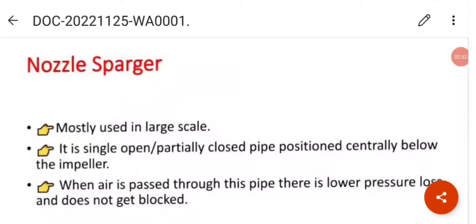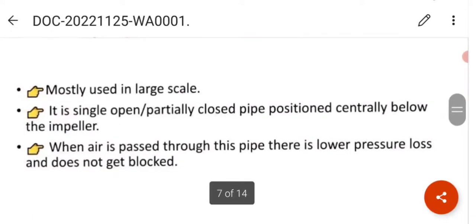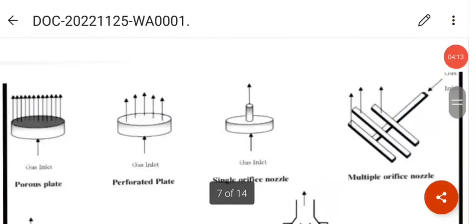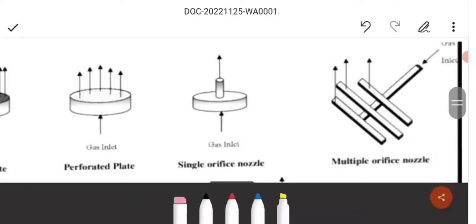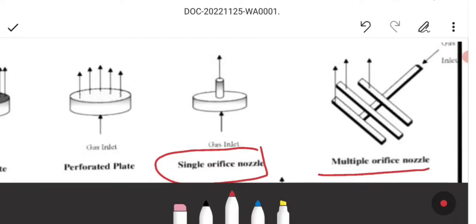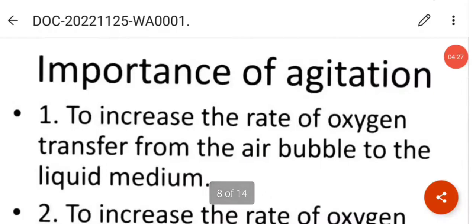The next category is the nozzle sparger. Nozzle sparger is mostly used in large scale industries and it is a single open or partially closed pipe positioned centrally below the impeller. When air is passed through this pipe, there is lower pressure loss and does not get blocked. Here you can see the single orifice nozzle and the multiple orifice nozzle sparger.